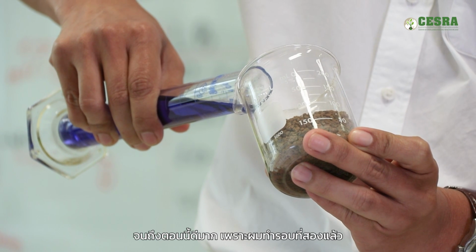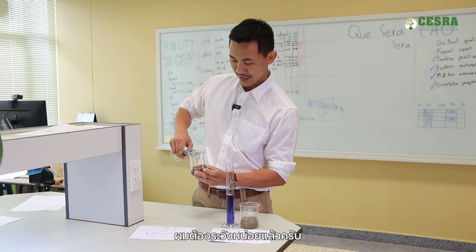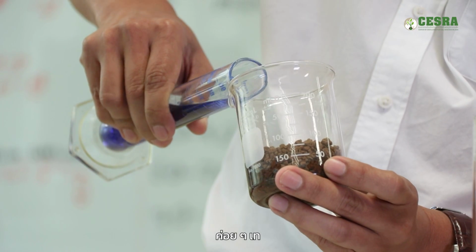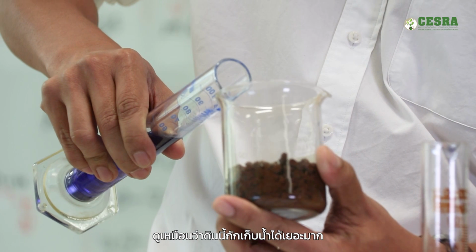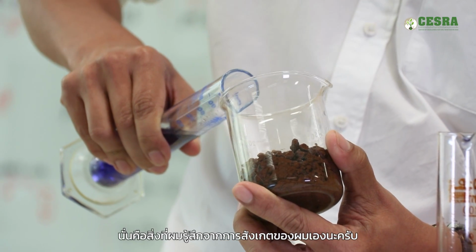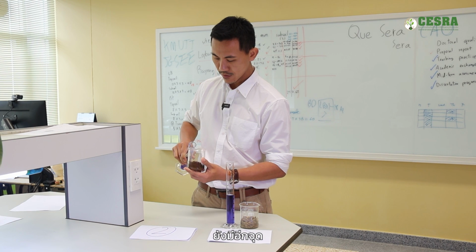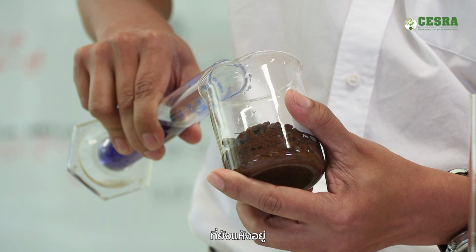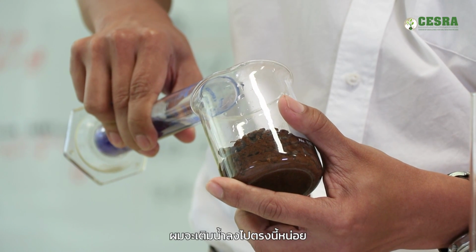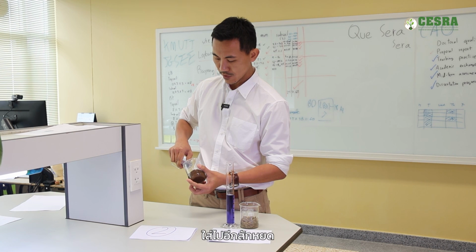This one so far so good, because this is the second time that I'm doing it. Okay, I've got to be careful. Slowly, okay. It seems like this soil can hold a lot of water. That's what I feel, I'm observing right now. And then, okay, we still have some spots left that are really dry. So I'm going to add some more here. A few more drops.